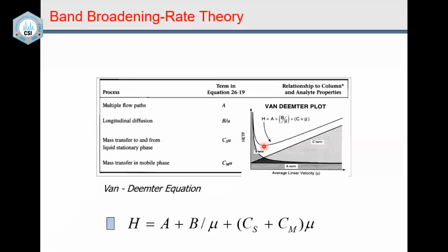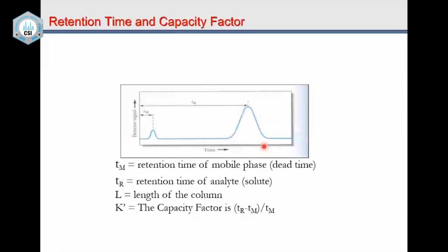Okay. Well, we are coming to some more mathematical terms which are very critical in chromatography, one of which is called the capacity factor. You have to understand this term very well, because when we put a sample onto a column, it gets carried away by the flow of the mobile phase and it comes out. The mobile phase itself starts from the same point and comes out.